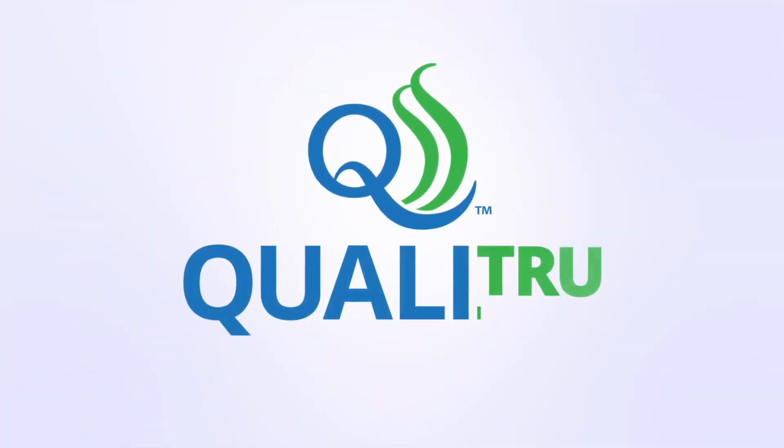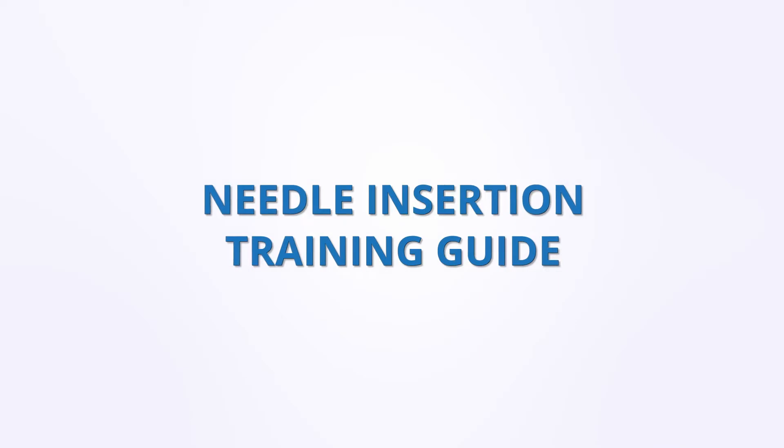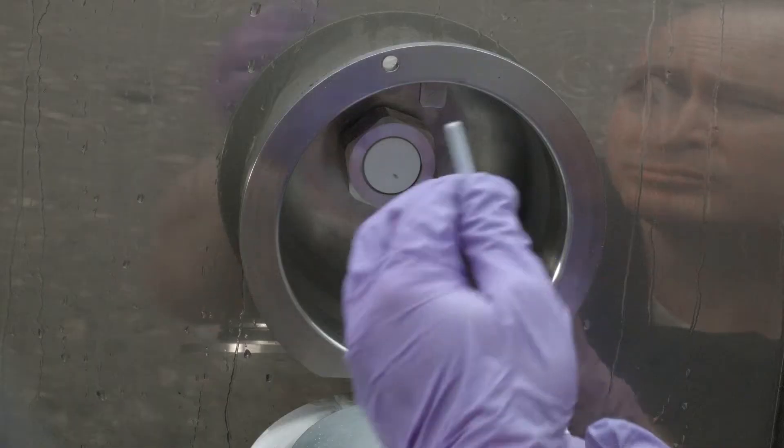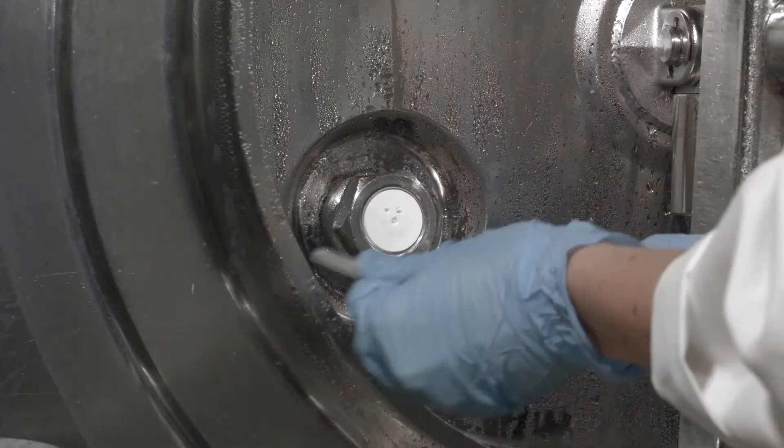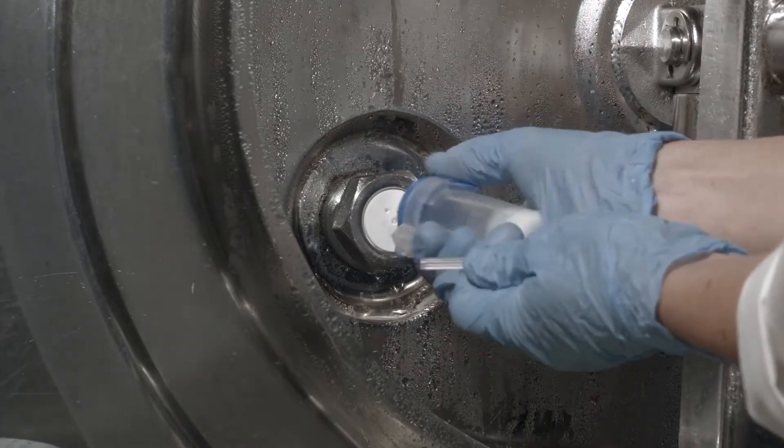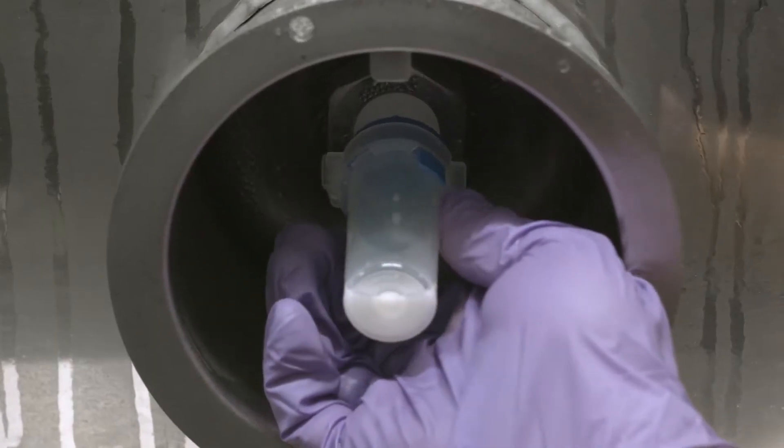Welcome to the QualiTrue Sampling System's Needle Insertion Training Guide. Whether you're on a farm, sampling from a milk tanker truck, or in a processing plant, the following tutorial will demonstrate the proper method for inserting a QualiTrue collection unit needle into a QualiTrue septum.